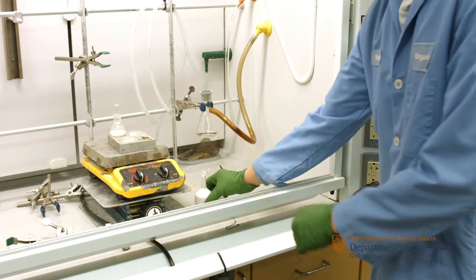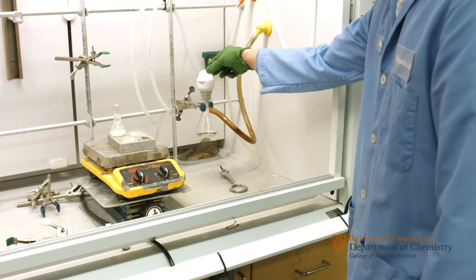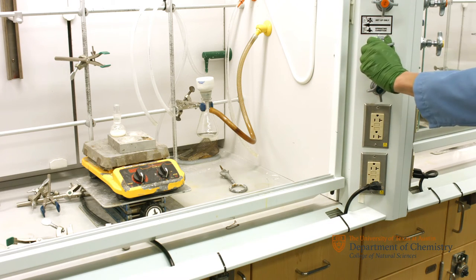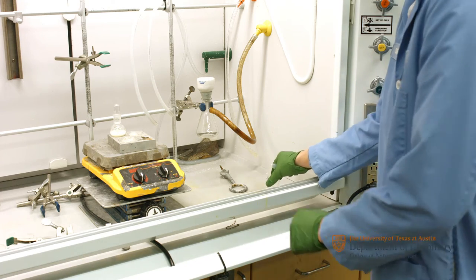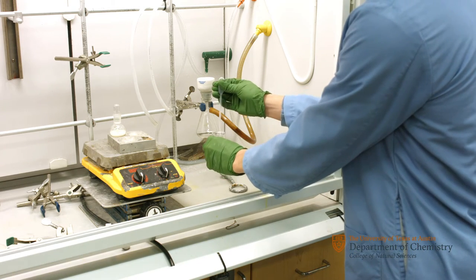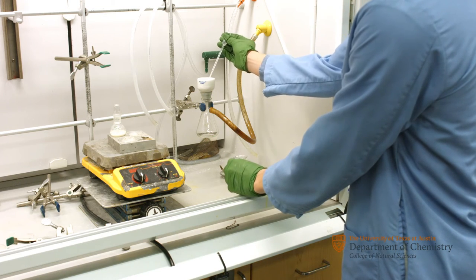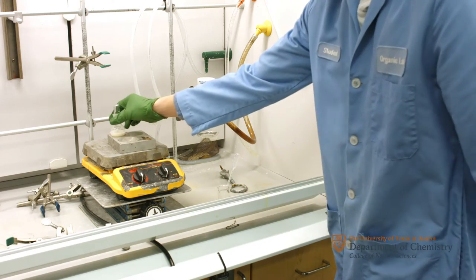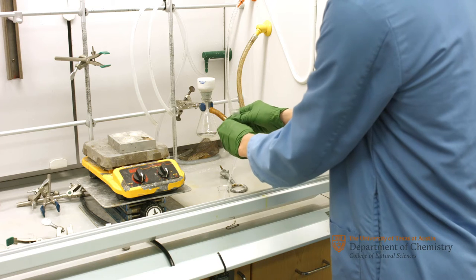Set up the vacuum filtration apparatus and place the Buchner funnel onto the rubber adapter. Next, place the filter paper into the funnel. Turn on the vacuum and rinse the paper with a small amount of DCM. Filter your product and rinse with about 2 milliliters of DCM.